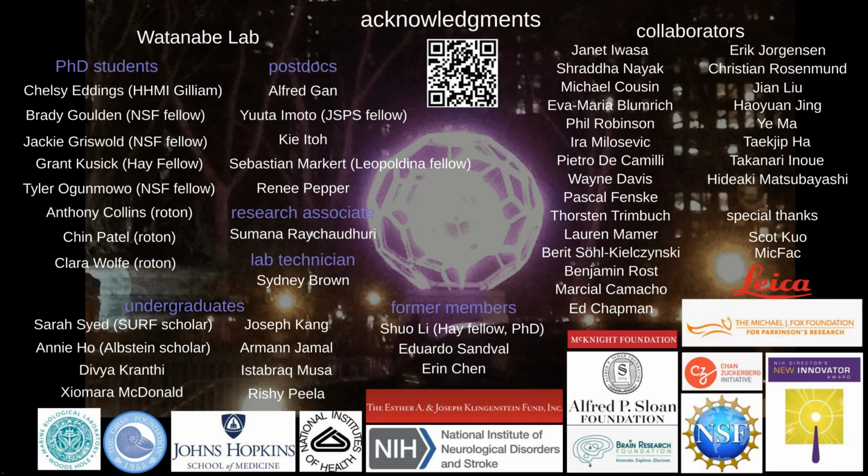For zap and freeze, it's a little trickier because unlike flash and freeze, where you're just doing channelrhodopsin stimulation, the field stimulation is a specific configuration. So the zap itself, as it works in the instrument, only happens in this closed sandwich, this closed thing that's not accessible to ephys, obviously, because it's a closed system. You can't put any electrodes in there, and it's not really accessible optically to things like directly measuring action potentials. That being said, there are two ways we've gotten around that.